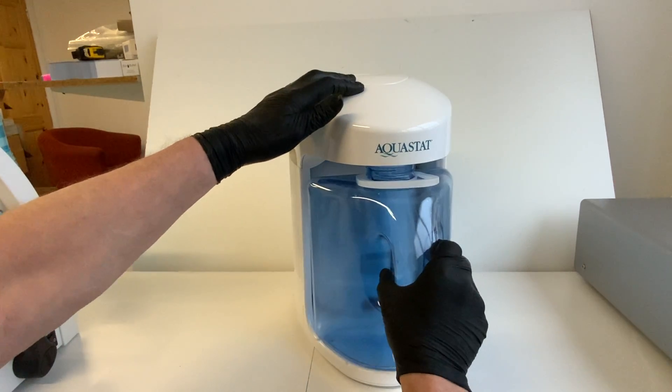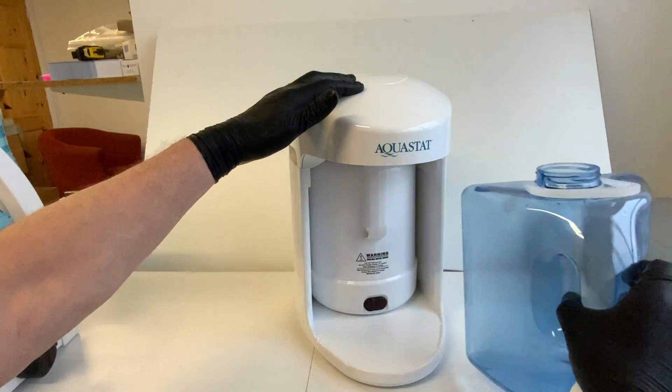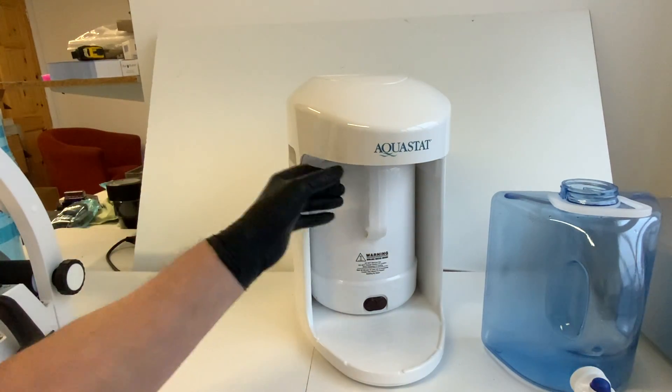There's the water bottle that will gather the distilled water, and in here it's a bit like a kettle.